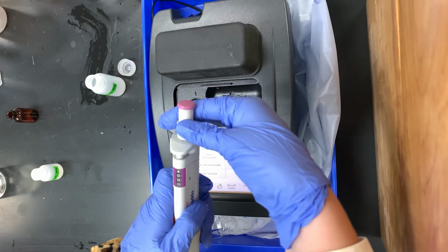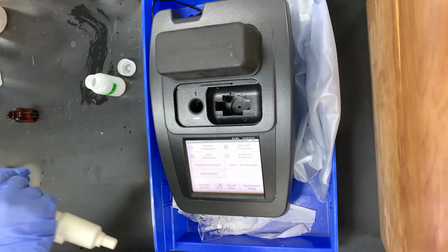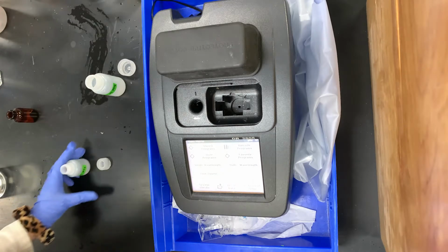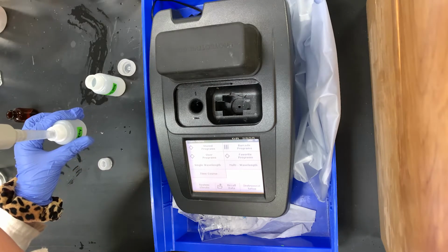So now that I've added the 56 mils of water into our 1 milligram per liter bottle, I can add 4 mils of the 15 milligram per liter standard.